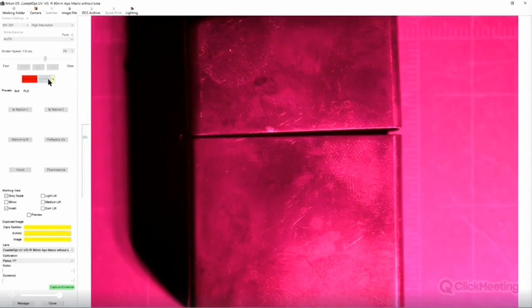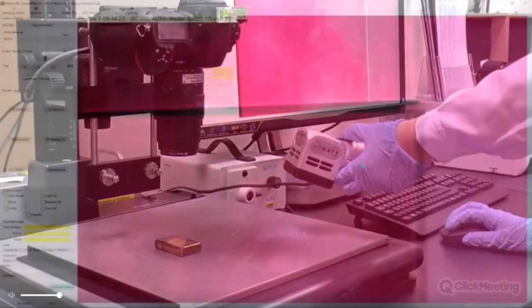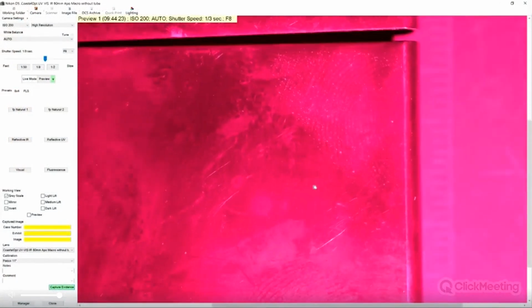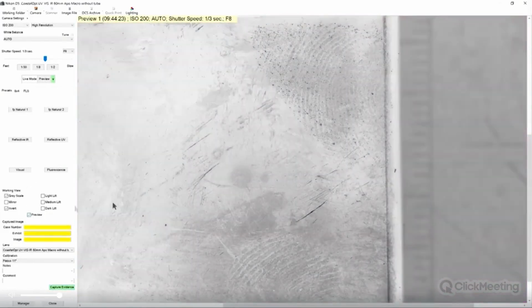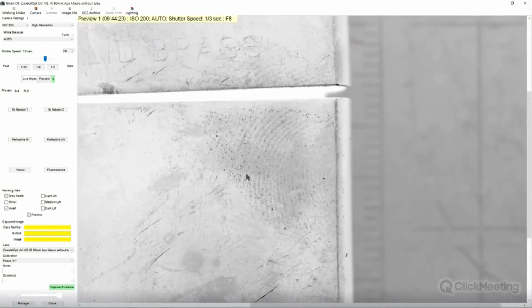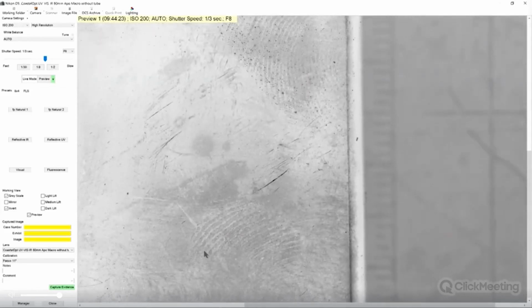What we'll do is we'll quickly take a preview. And if we zoom in, we can start to see the presence of multiple finger marks across the surface. We change to grayscale. We can see some finger marks, including a partial print along the bottom, even containing some third level detail.